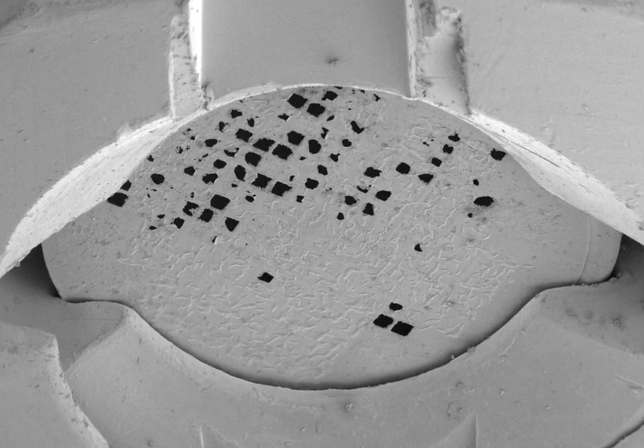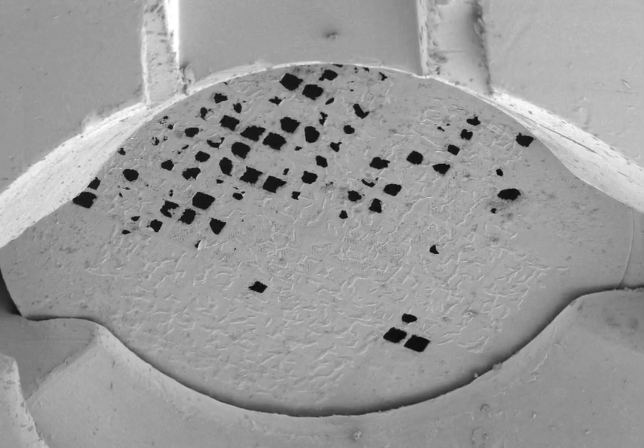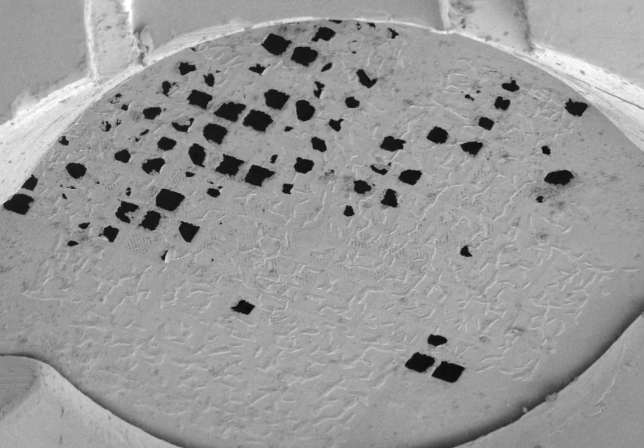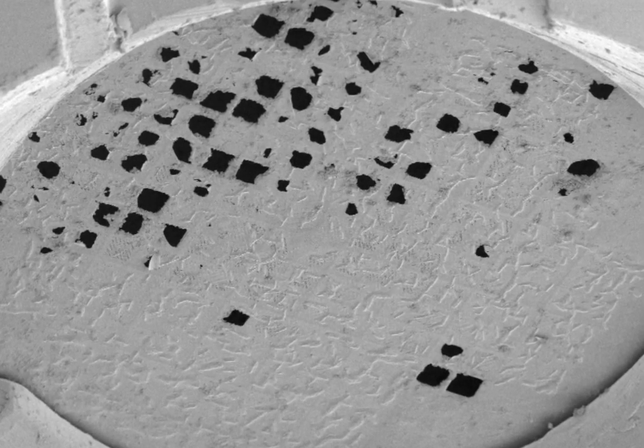Cells that were plunge frozen directly on EM grids were sputter coated with platinum to improve milling properties, and then they were transferred into a dual beam scanning electron microscope and focused ion beam mill equipped with a cryo stage.